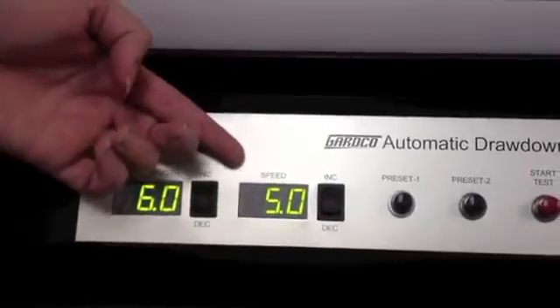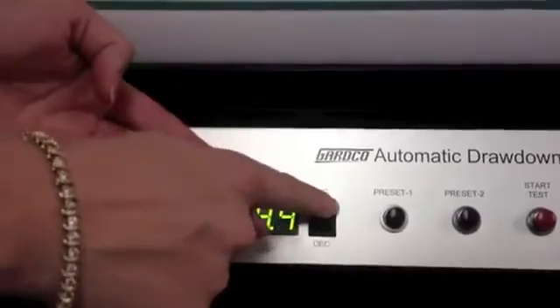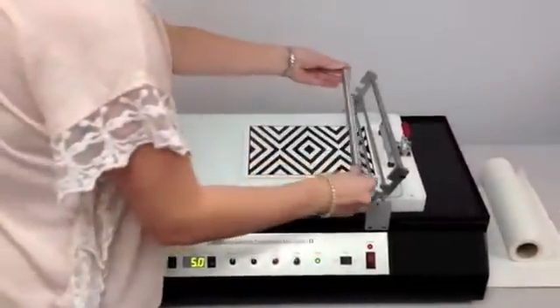Select the desired stroke length and test speed using the rocker switches. There are two programmable presets that can be easily set to store the stroke length and speed you most commonly use.